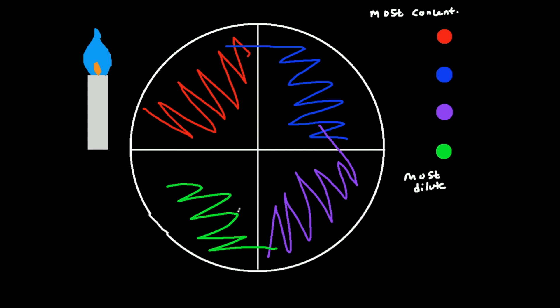After doing this, all four quadrants should have bacteria in them. But why go through the trouble of doing it four separate times and sterilizing between each one? The first quadrant in red should be the most concentrated with bacteria — when this grows in the incubator, you'll see the most bacteria there because I took it directly out of the stock culture. Then I sterilized again and did the blue streak in the second quadrant, which should be the second most concentrated but more dilute than the red. The reason I dragged through only a small part of the red was to take just some of the cells along — not all of them — so two is more dilute than one.